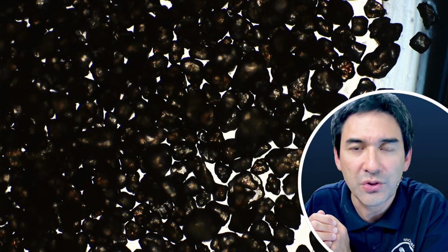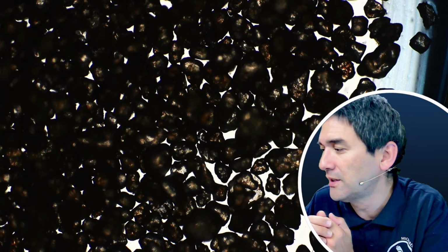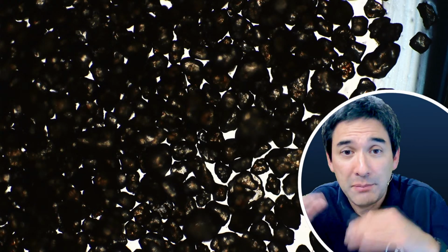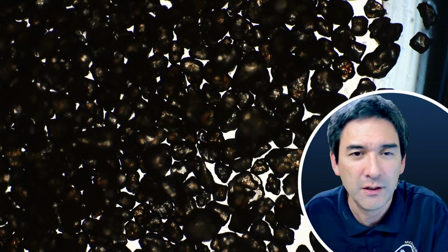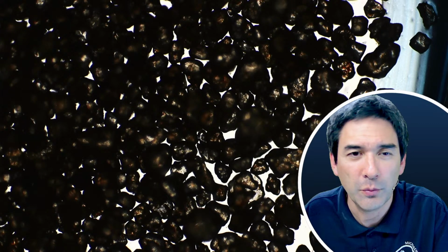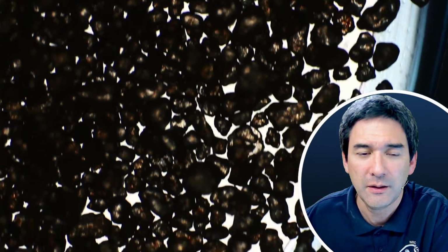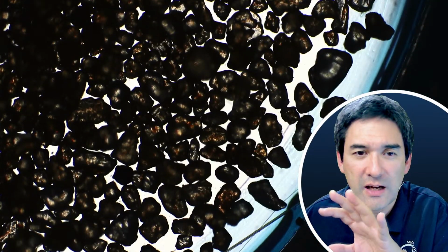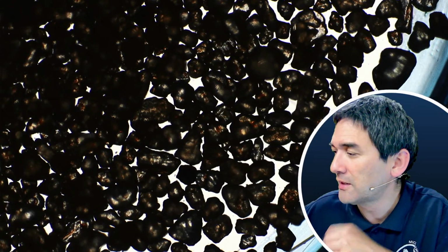Okay, and you also do not see the red color anymore. And yeah, so this is basically the reason why those slides are actually suitable for epi illumination. You see, unfortunately, every now and then you see the pink picture flashing. There's some problem with my HDMI to USB converter, I think. Every time you see this noise and this flash, unfortunately, I don't know why it's doing that. So that's a 4x objective.